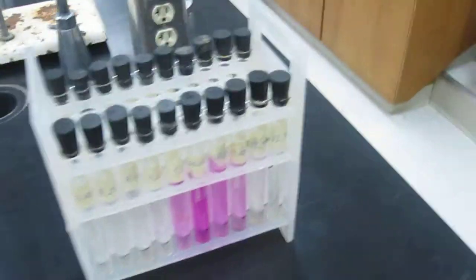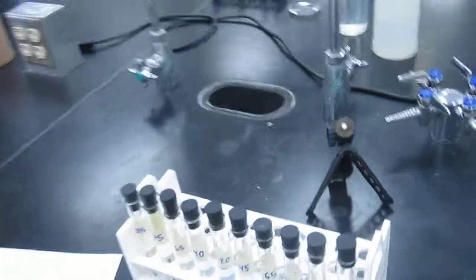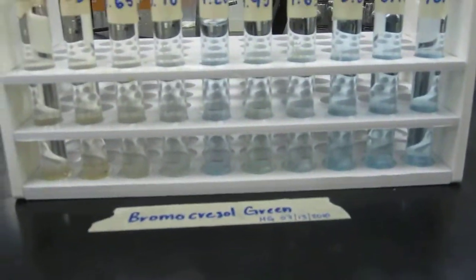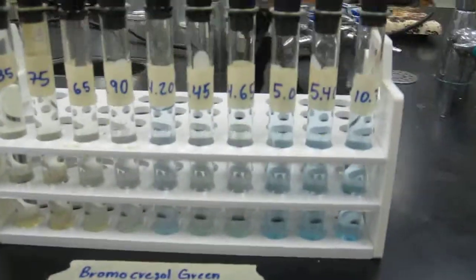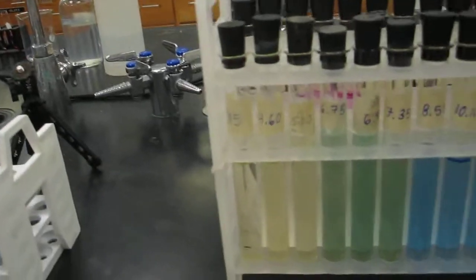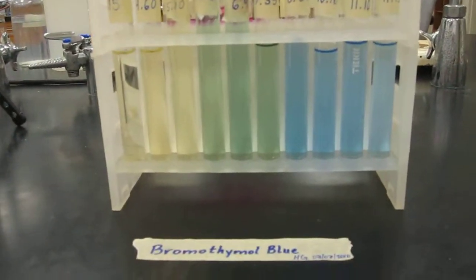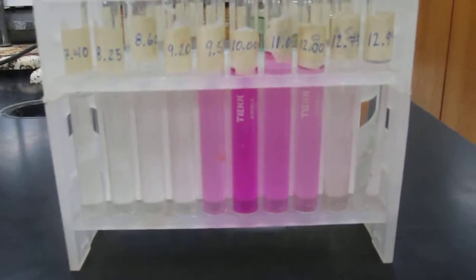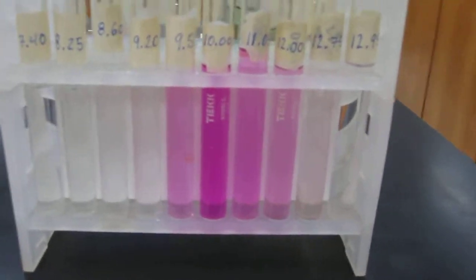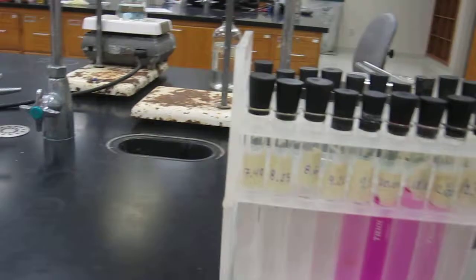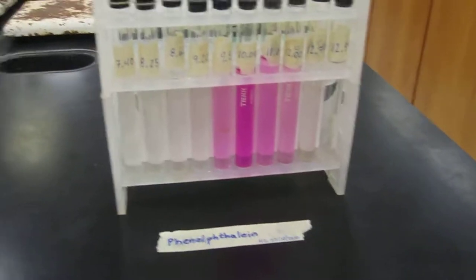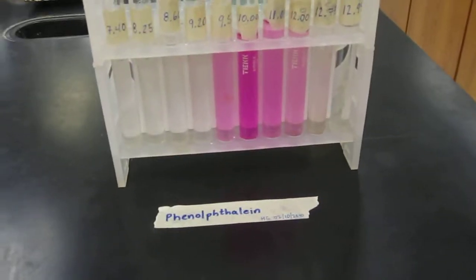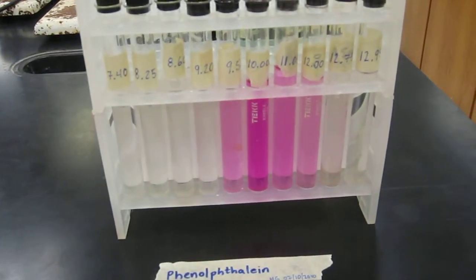So those are the three indicators you'll be using. Bromocresol green for the range 4 to 6, bromothymol blue for the range 6 to 8, and phenolphthalein with the range 8 to 10. And you'll just be comparing your test tube to the colors here, and if they match up, then you can say that it's about that pH.